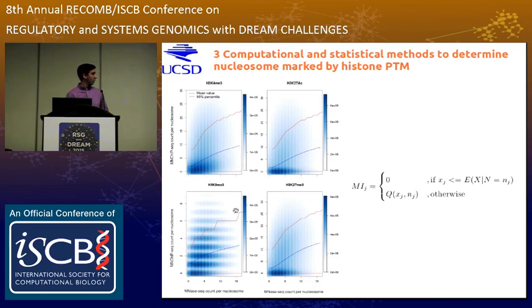So for example, for a nucleosome that contains 15 MNase-seq reads, we call it enriched by H3K9 methylation only if it contains 6 or more footprints of that histone mark. This generated between 600,000 and 800,000 enriched nucleosomes across these 4 histone marks.